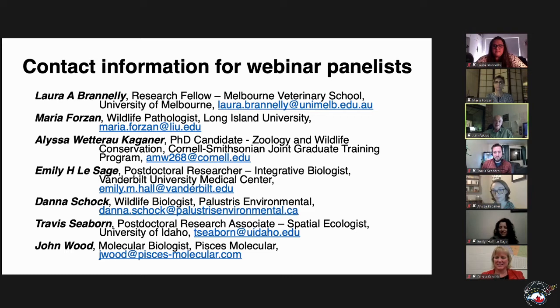So if you're going to use desiccant, which is perfectly fine, at least fold the filter sample in half so that the inside, the environment side of the filter, is folded in and is not being rubbed or abraded or stuck to by the desiccant beads. Another thing that we've actually run into is people saying, well, we preserve many samples in alcohol, so we'll just put the filter in alcohol. Well, but that washes everything off the filter. And so now I have to test both the filter and the alcohol. So no, we don't like filters like that.